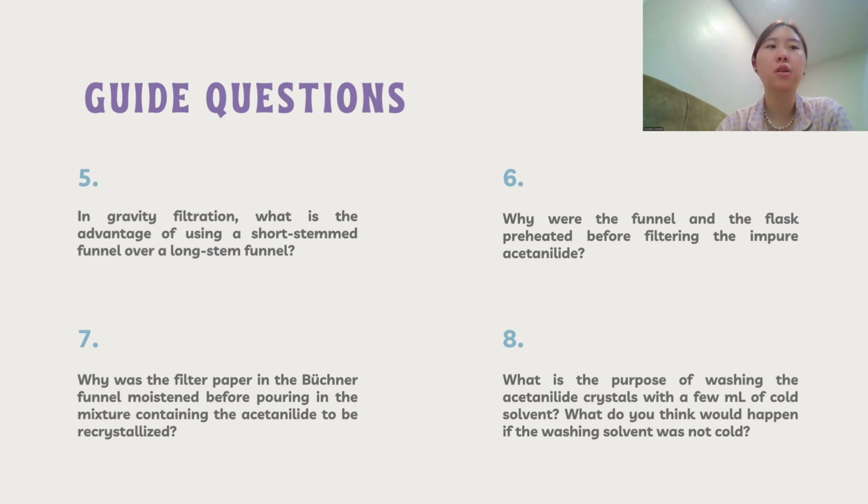And number 8, what is the purpose of washing acetanilide crystals with a few milliliters of cold solvent? What do you think would happen if the solvent washing was not cold? The primary purpose of washing with cold solvent is to remove residual impurities that may adhere to the surface of acetanilide crystals, since some impurities may remain trapped or adsorbed on the surface of the crystals despite the purification step. Also, using a cold solvent would keep the crystals from dissolving.